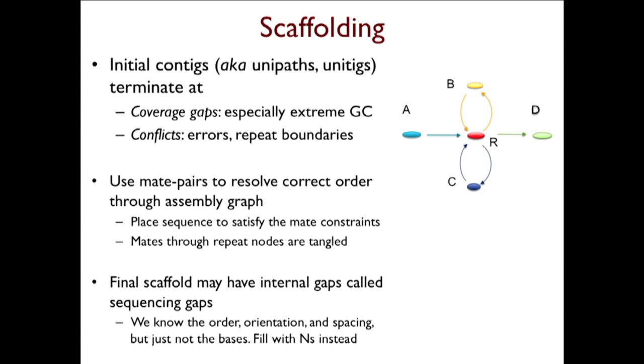So again, a little cartoon diagram: this is the assembly graph that's constructed by comparing the sequences to each other. From the assembly graph that's present, it's not clear if it goes A, then repeat B, repeat C, repeat D, or if C should come before B. But if we had some sort of mate pair information that we could overlay on top of this, what we hope will happen is these unique segments will get linked up in such a way to disambiguate who gets connected to who.